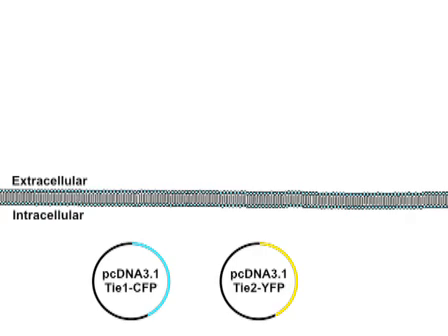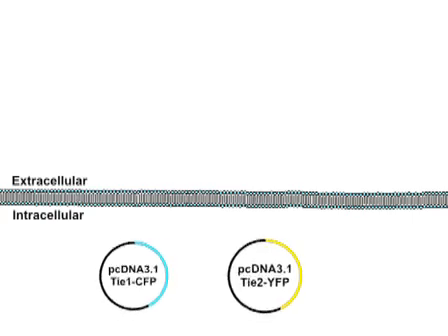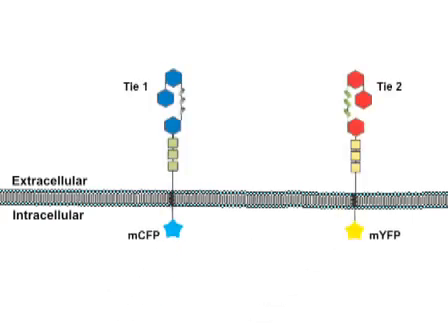At this point, the fluorophores aid in evaluating the overall extent of expression as well as receptor localization. Next, the imaging parameters are established using single transfectants as a control on the confocal microscope. Individually transfected cells are selected based on their relative levels of receptor expression and localization. Regions within these cells are then imaged in order to evaluate the extent of FRET.